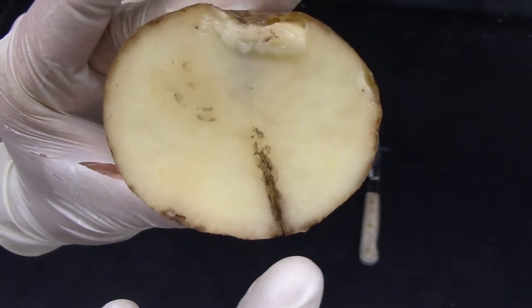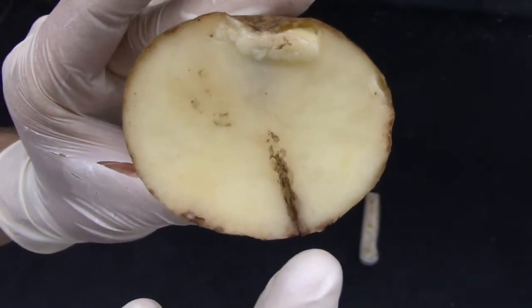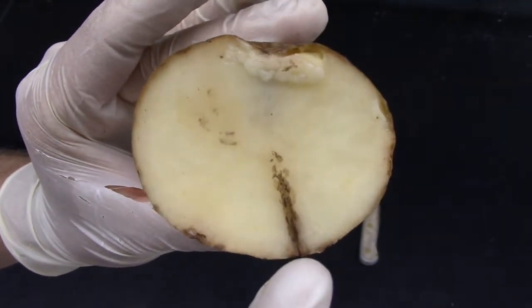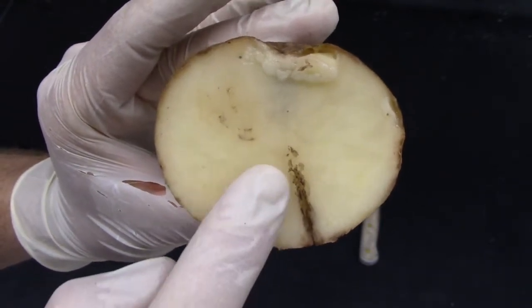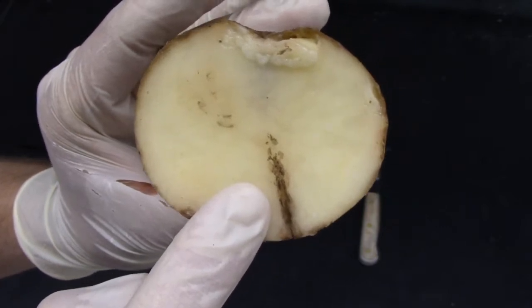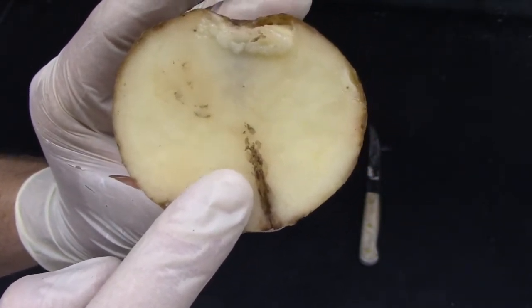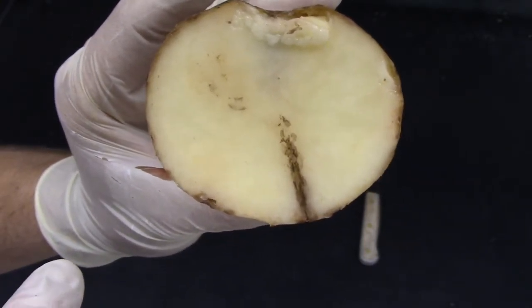On the bottom, we see what's actually cork formation. So in this case, this was my second point of inoculation on this potato. However, instead of the bacteria infecting the tissue, the potato actually mounted a successful defense response by forming cork on the side of the toothpick wound. Cork is kind of analogous to human scab tissue, and it produces a physical barrier that prevents the bacteria from actually infecting the healthy cells.